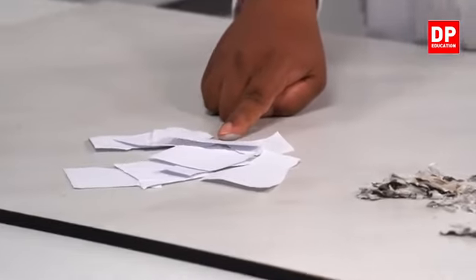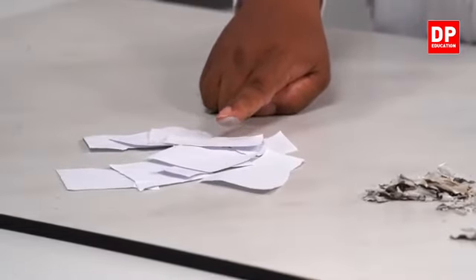The composition of the paper, composition means the amount and the type of matter contained inside this paper. So it hasn't changed, even though the size has been changed, right?